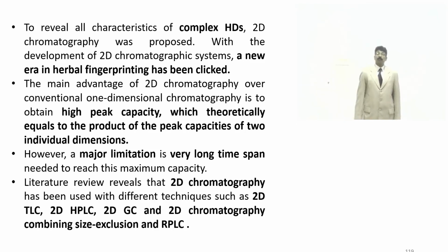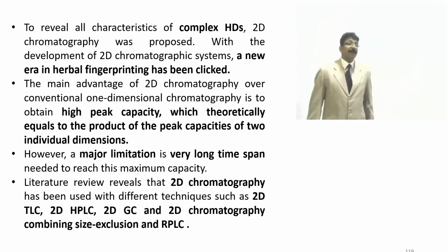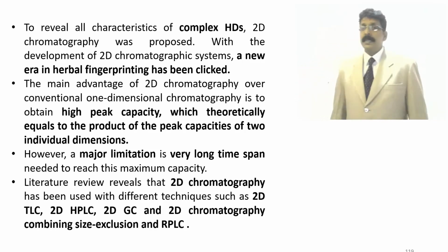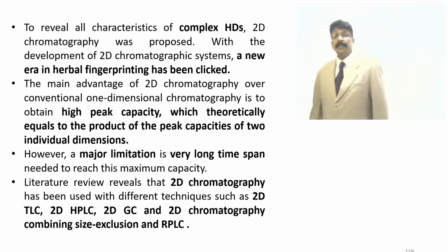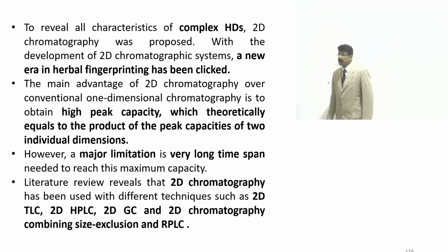and it can be called 2D chromatography. So you have now got an idea about what the difference is between hyphenated techniques, hyphenated detection, and what we mean by 2D chromatography. So you should explain them. They both have similarity, but when you are using 2 chromatographies, then you can say 2D chromatography.